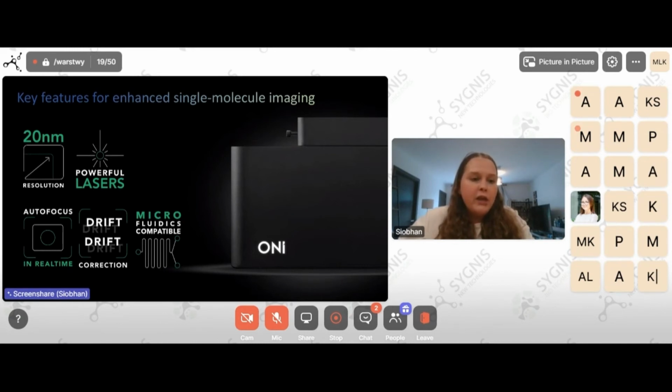We have an autofocus option. This essentially allows you to find your focal plane within the system and lock its focus. This means that if you move around or if you carry out high frame dSTORM imaging, you won't get any drift within the sample. However, if there is some small drift, the sample hasn't warmed up to the microscope temperature, or there's just any thermal drift from the laser power, we do have a pretty good correlated drift correction within the system as well, which can be applied after the super resolution image has finished.